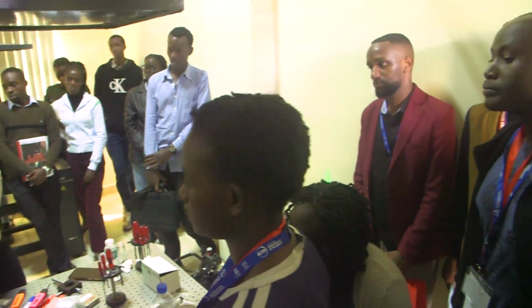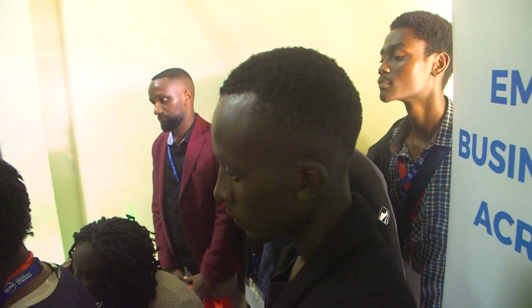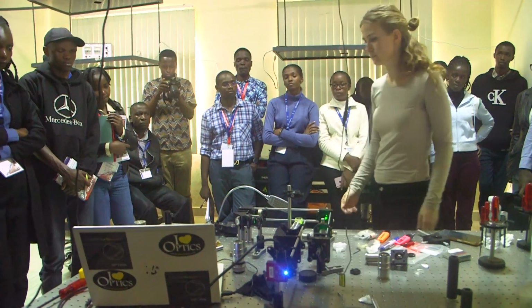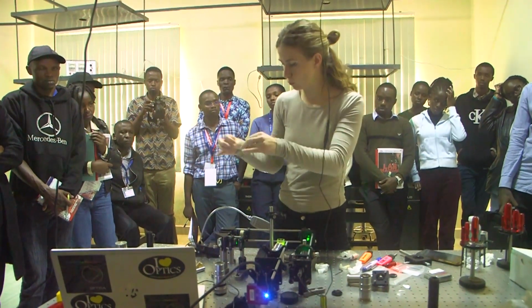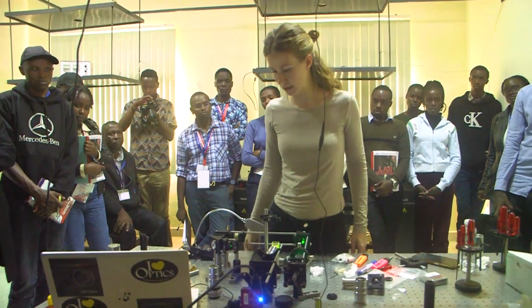So I've put here another mirror in the focal plane of this other lens. That's how I'm going to be able to move my light sheet in three-dimensional space.